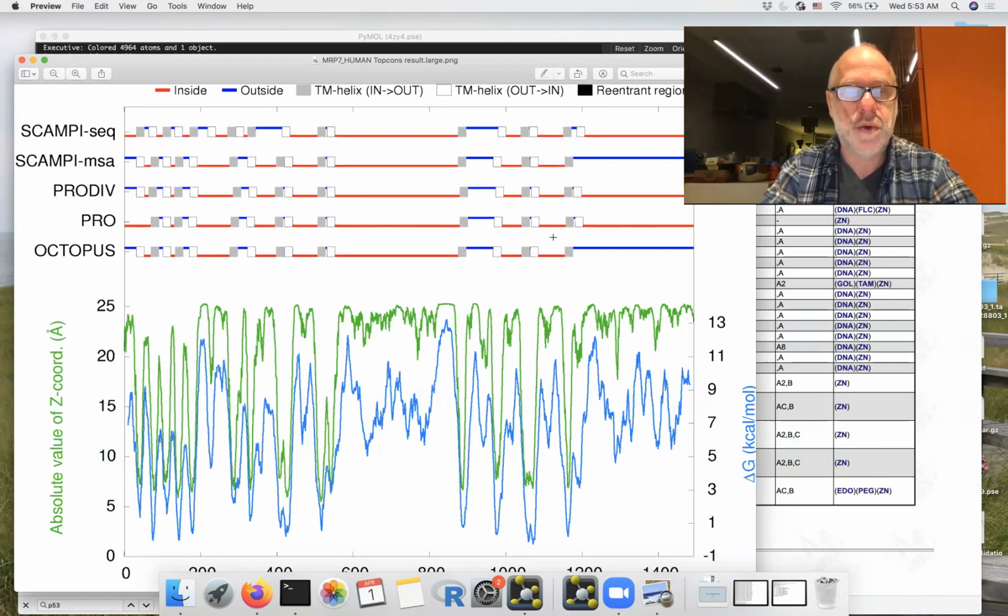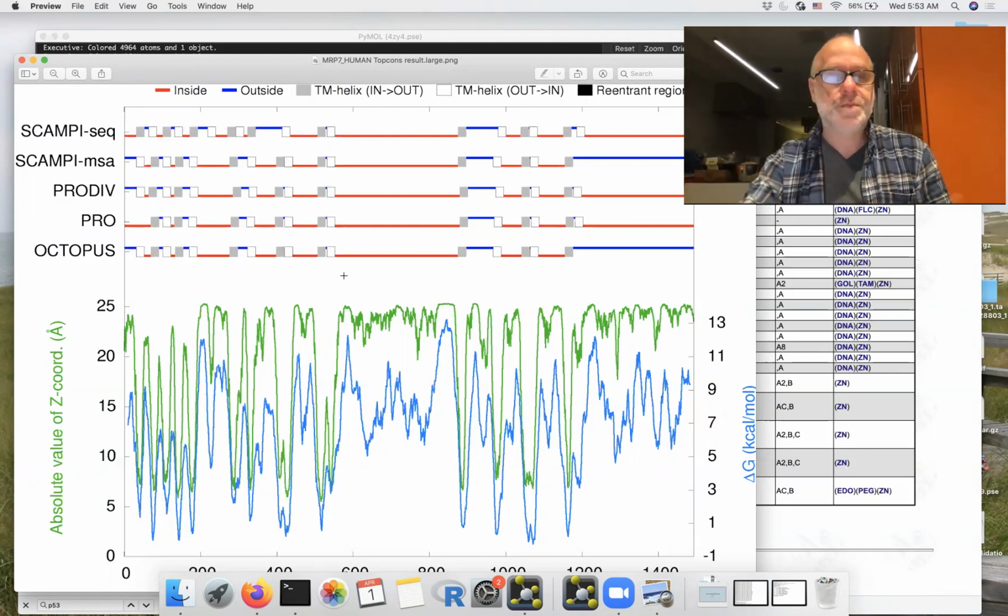And so this protein has 3 domains. It has a 6 here, another 6 here, and I think 1, 2, 3, 4, 5 here. Maybe, and this one might be right, might be 6 actually. So it's got, and probably kind of disordered residues in between.